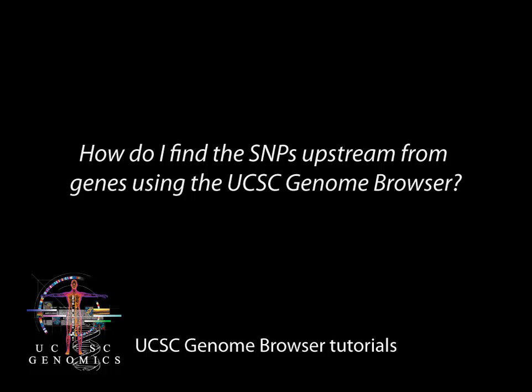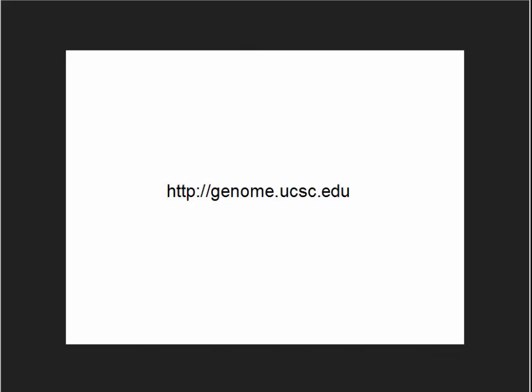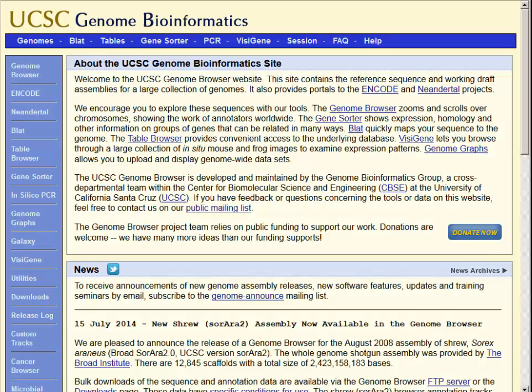This tutorial will show how to find all the single nucleotide polymorphisms upstream from genes using the UCSC Genome Browser. The genome browser is found at genome.ucsc.edu.